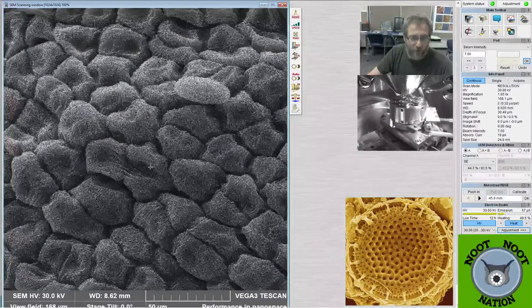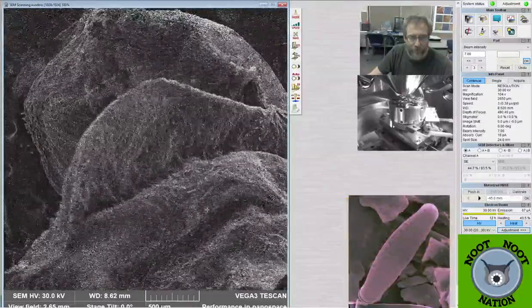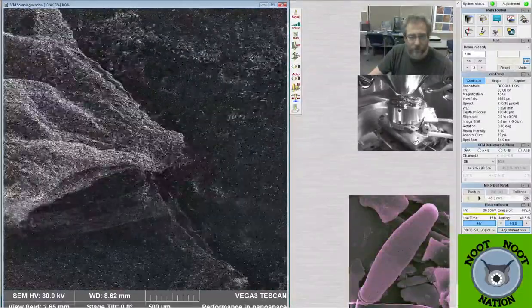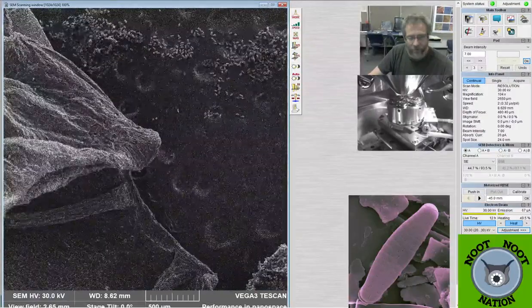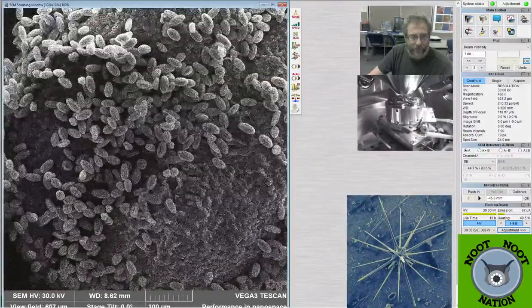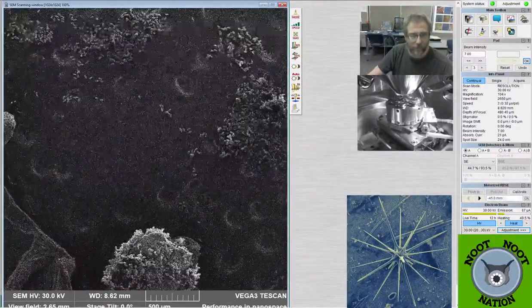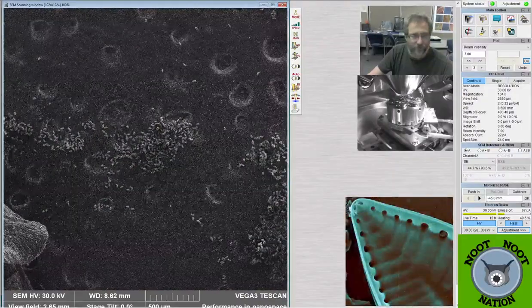And it could just be the groups or families that the plants belong to, or it could be the part of the plant that we're looking at as well. So this is where the petal actually joins the plant right here that I ripped off. And then these are the anthers right here. You can always tell them because they're just covered with pollen, right? The whole thing just has pollen all over it.